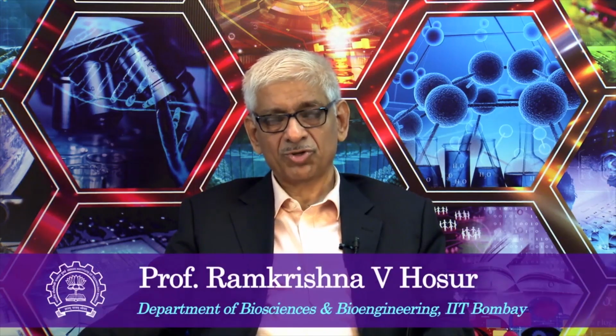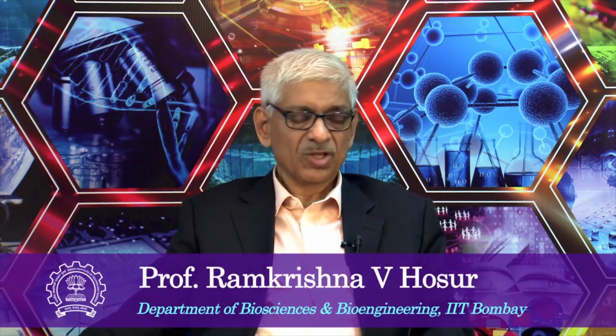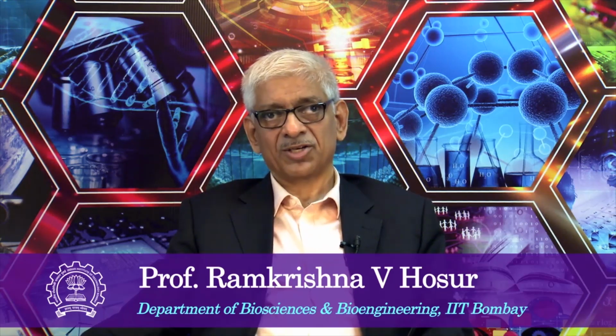If you choose coherences, then you get J correlated spectra. If you choose Z magnetization, then you get dipolarly correlated spectra, in which protons are correlated through dipolar interactions, and therefore they carry distance information. In the other case, the J coupling information is obtainable. So this 2D NMR provides a variety of possibilities for obtaining the desired kind of information in your spectrum, and that has been the biggest revolution in NMR spectroscopy. So we will stop here and continue with other pulse sequences in the next class.